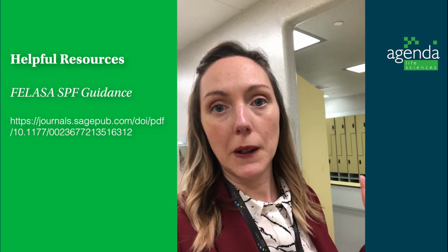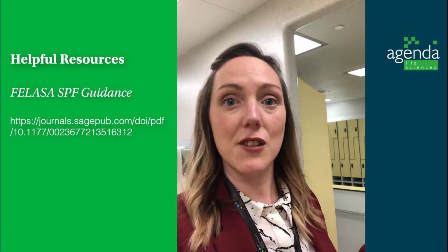We pick up outside pathogens, dust, dander, lots of things that can actually challenge the immune system of an animal in a research unit, and we want to keep that on this side of the barrier, hence removal of clothes, covering of hair, potentially even a wet shower. By maintaining an SPF barrier, we are limiting the variation in data. So the link there is any immunological challenge that the animal experiences has the potential to introduce variation in experimental data. That's not what we want.